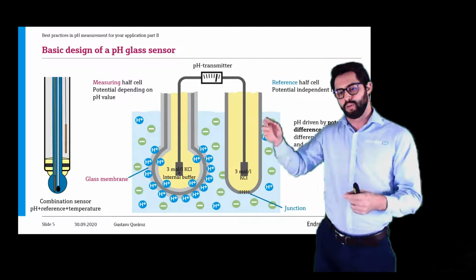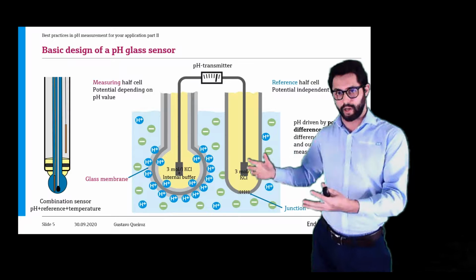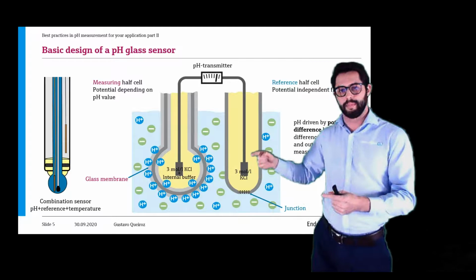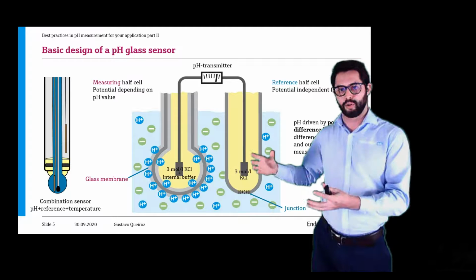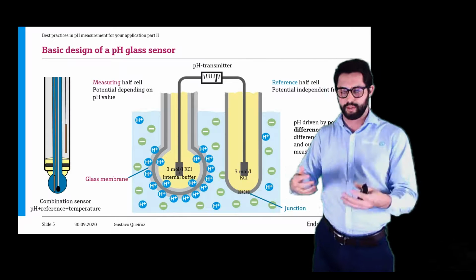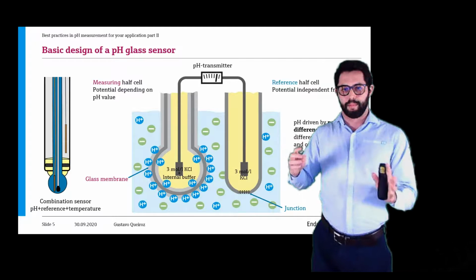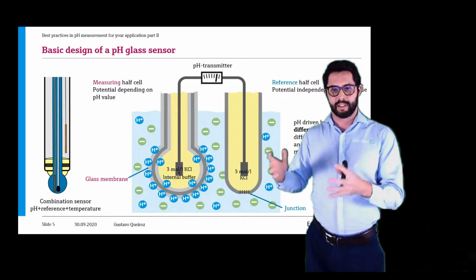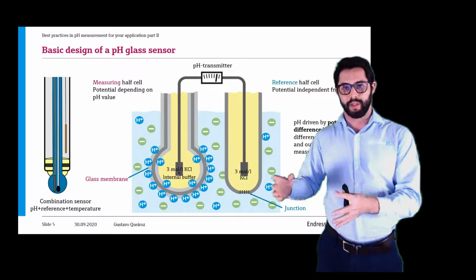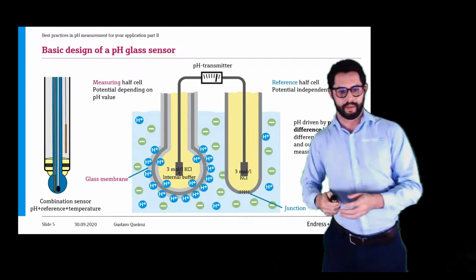As soon as you install your pH electrode and it starts to work, it will start losing part of the salt concentration to the outside due to the diffusion process. Have this in mind because we're going to approach some of the concepts and some of the technologies we have available today to increase the pH electrode's lifetime.